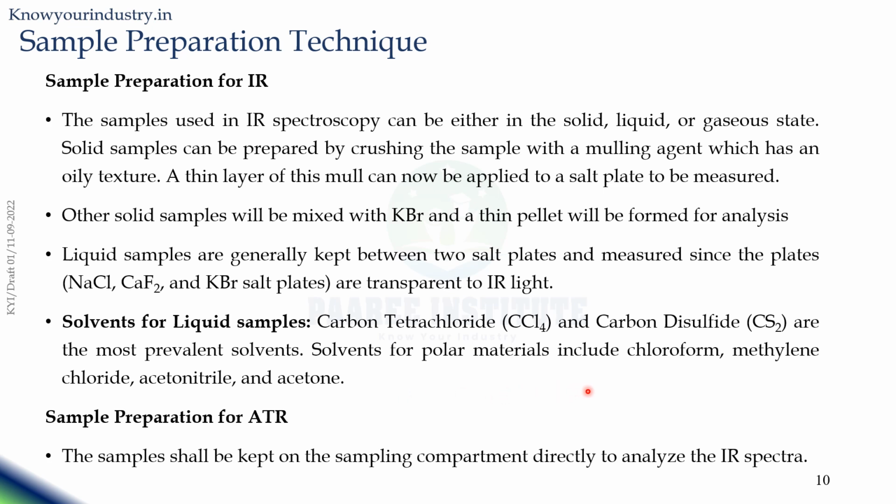Solvents for polar materials can include chloroform, methylene chloride, acetonitrile and acetone. And in the case of attenuated total reflection IR spectroscopy, you can use the sample directly to analyze the IR spectrum.